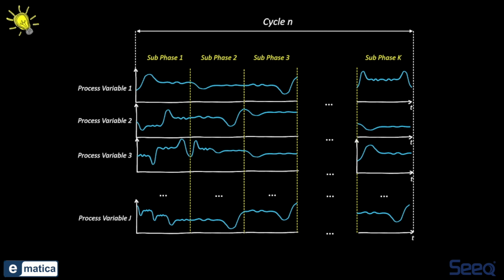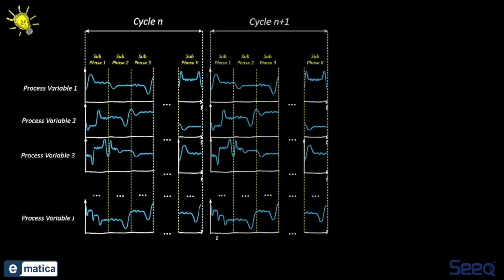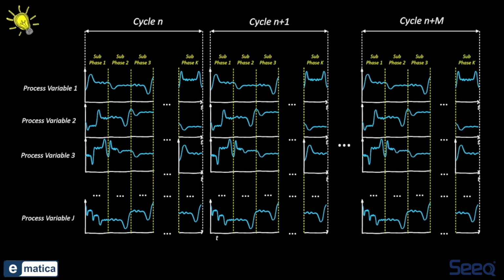So what do we do? I cannot name these variables, unfortunately. So just imagine a cycle which is divided into phases, such as heating, decontamination of units, and here you have sensors, which are different for each cycle. Now, what we know, thanks to engineers, is that cycles are repeated. For each process, cycles are repeated. So in this case, we have this phase for each cycle. The blue line represents the repetition of the cycle.